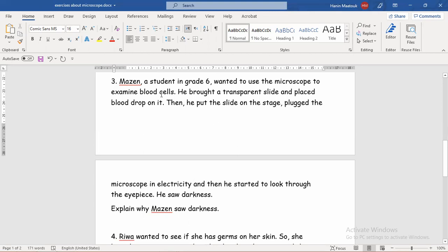If we follow the steps Mazen did: he brought the microscope, put the slide with blood on it, placed it on the stage — everything is correct so far. He plugged the microscope into electricity, and then started to look through the eyepiece. So we have a missing step: he did not turn on the light. He plugged the microscope in, but there is an on/off button. He didn't turn on the light, and that's why he saw darkness.